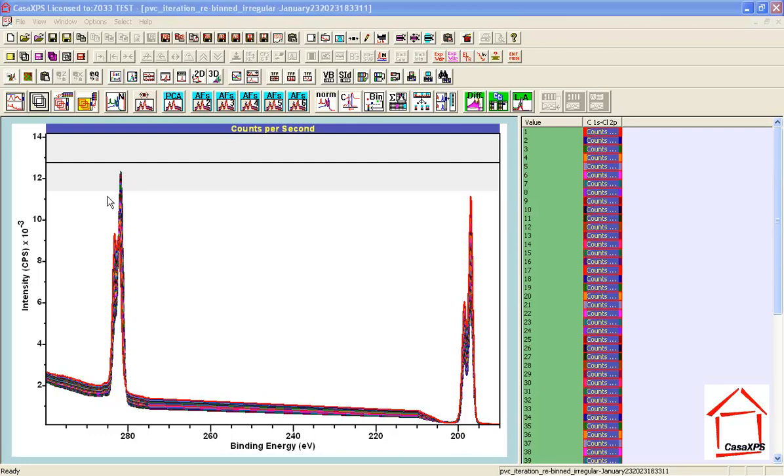So ideally we want to choose two spectra that are the greatest distance apart in some sense. In fact, it's the angle between these two vectors in a vector sense that makes the biggest difference. So in terms of this data set, the two spectra with the greatest variation will be the first and the last. Now previously, if I wanted to do a difference calculation using the calculator property page, I would have to overlay two spectra. In this case, I've overlaid all of these spectra, and they are overlaid in the order that they were selected in the right hand side, which means that the first one and the last one actually represent the greatest variation.